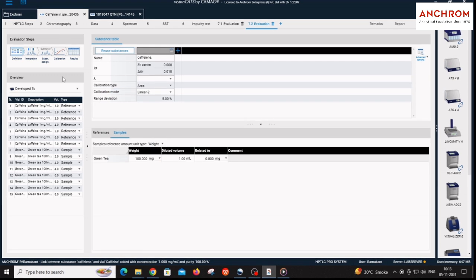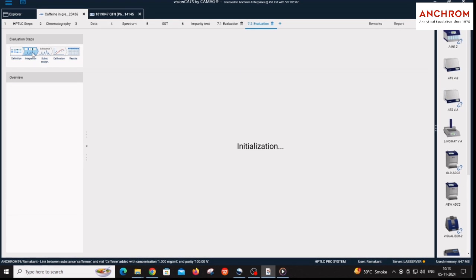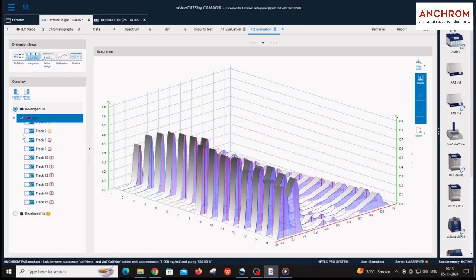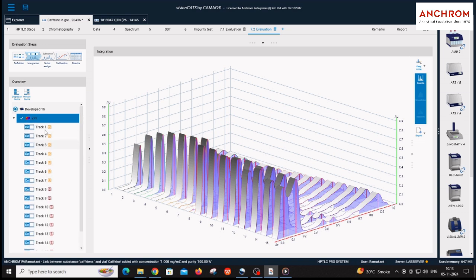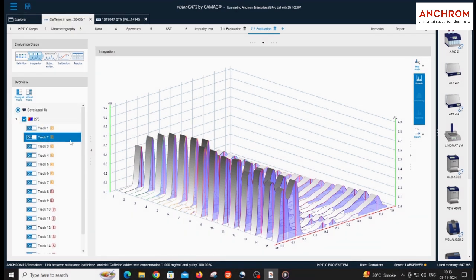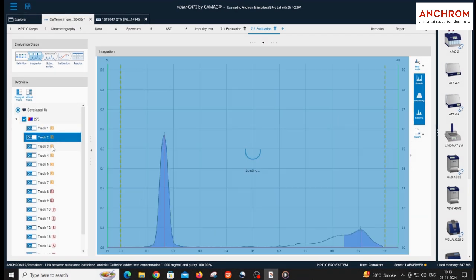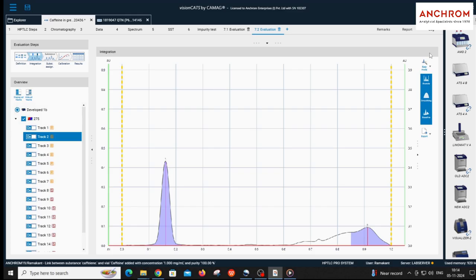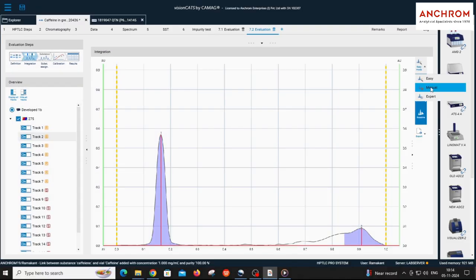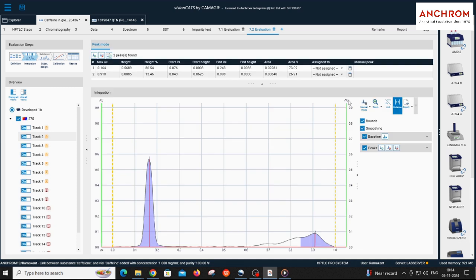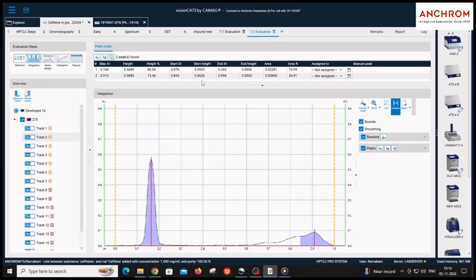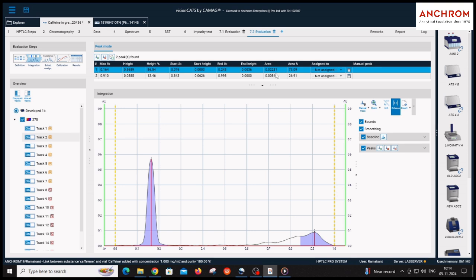Click on the integration step and select the wavelength under which the scanning is done. Check individual tracks to view the separated peaks in each track. Click on easy mode and select manual mode. Under manual mode you can evaluate the peak RF and height at start, end, and max position. Evaluate peak area, area percentage, height, and height percentage.